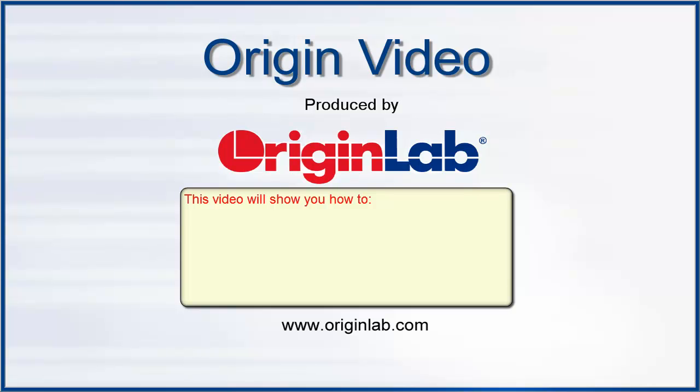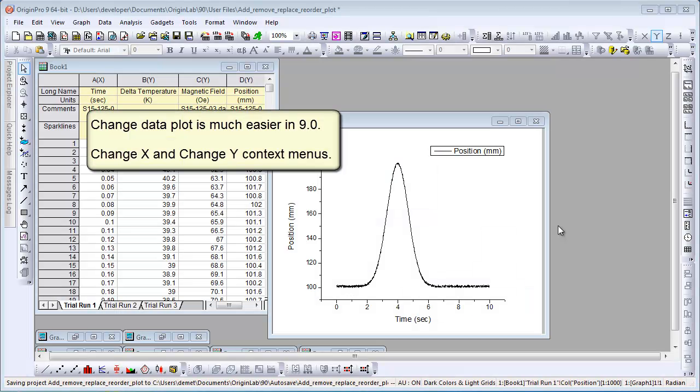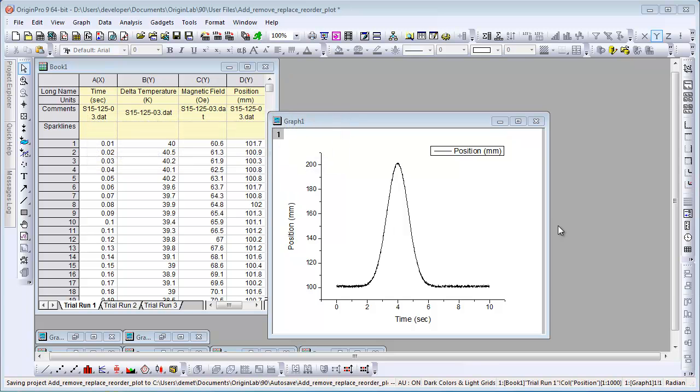This video will show you how to manipulate data plots in Origin, such as change, add, remove, hide, and reorder data plots. In Origin 9, we added Change X and Change Y context menus to easily change data plots. There is a separate video on this, so here I will just show a brief example.